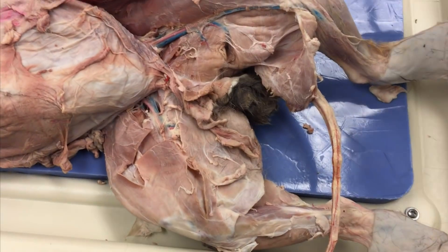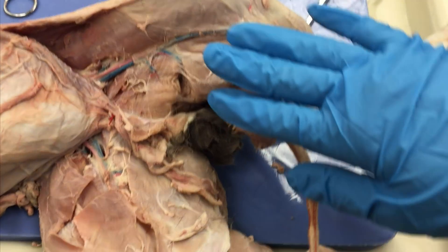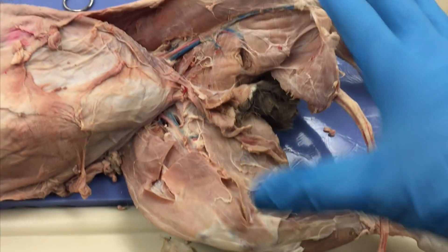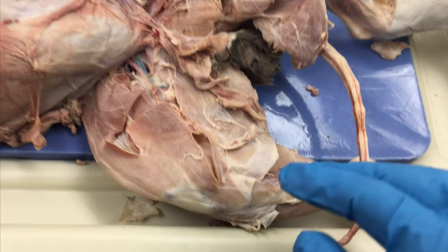Good morning team. Today we're going to be working on our leg. I've shown you the superficial side, and then we'll get into the deep side of the cat leg. We're looking at the medial aspect here and we're going to start off with the thigh.